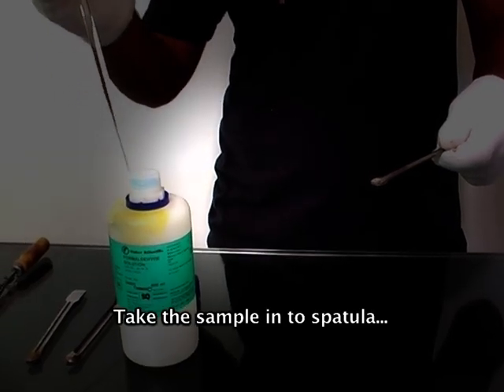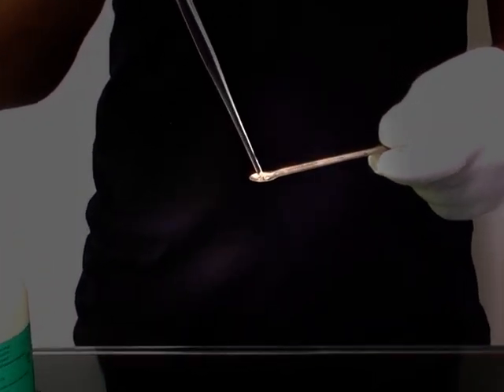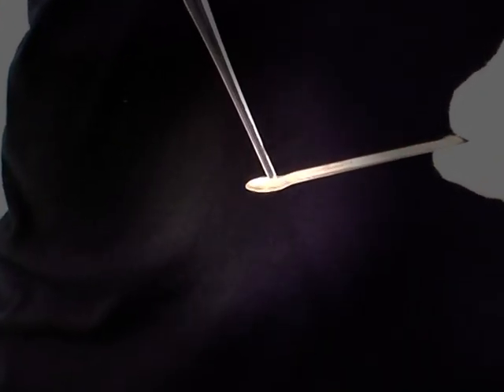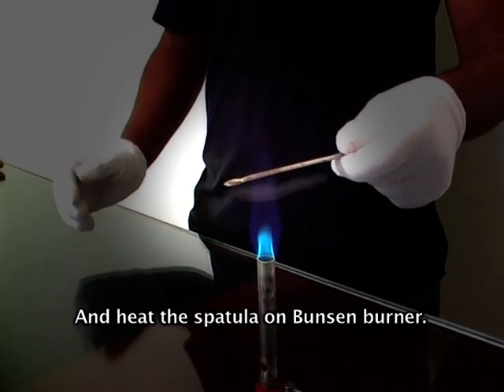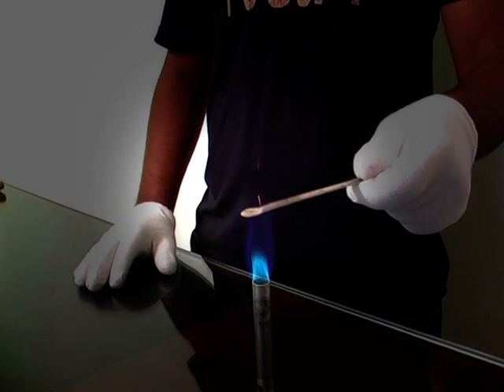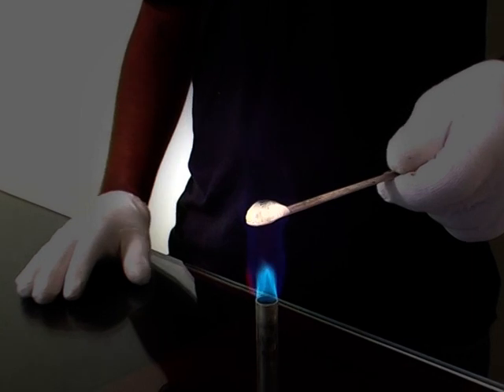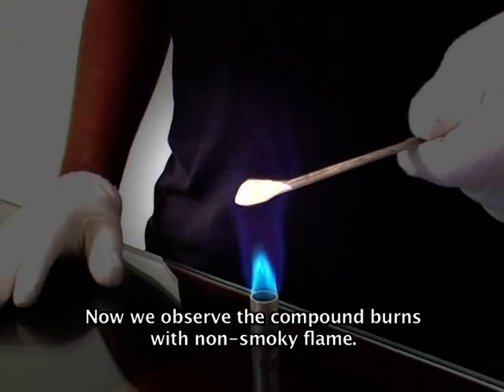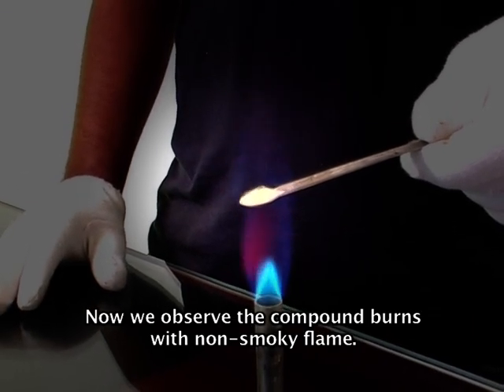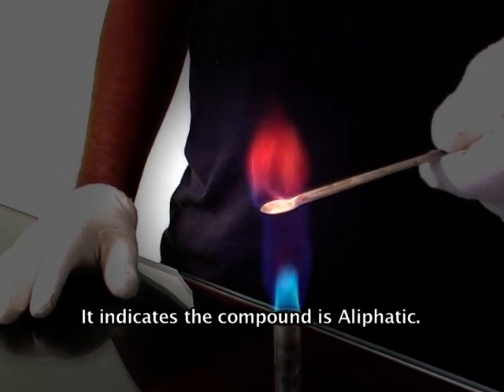Take the sample into a spatula and heat the spatula on a Bunsen burner. Now we observe the compound burns with a non-smoky flame. This indicates the compound is aliphatic.